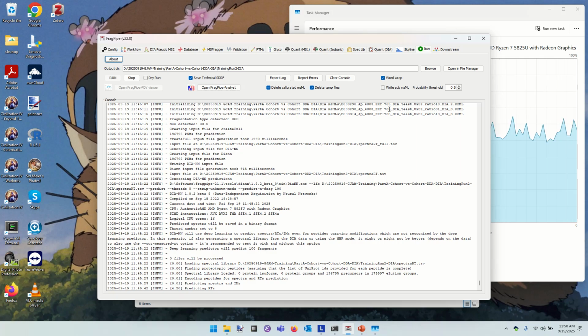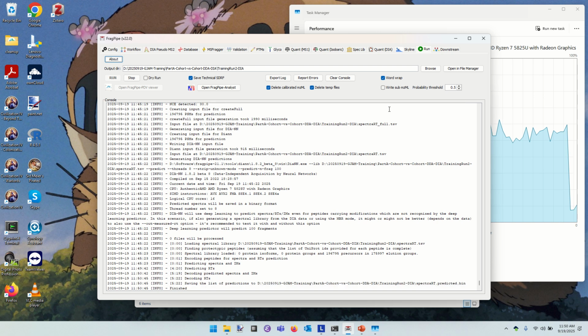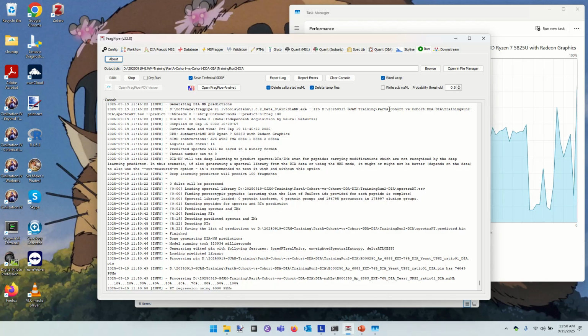The short version is that the spectral library represents the set of peptides that we are going to then go quantify in this DIA data set. If I gave it a bunch of random peptides that don't really exist, but I put them in my spectral library anyway, the software will dutifully come back with some quantification value, some intensity value for ions that it sees for this non-existent peptide. So having a larger number of peptides than are really present is a bit problematic for that. It's tempted to go look for quantities that don't exist.